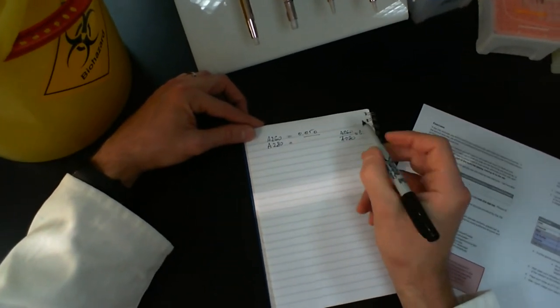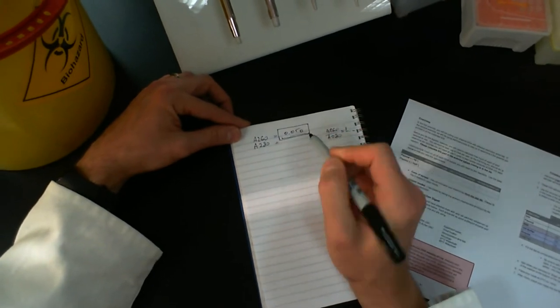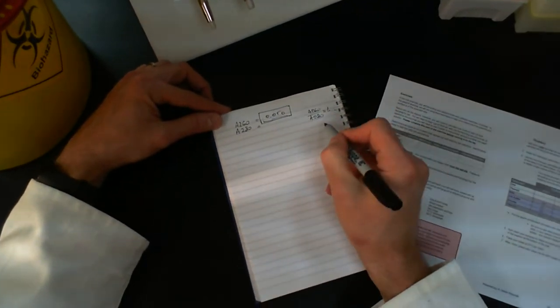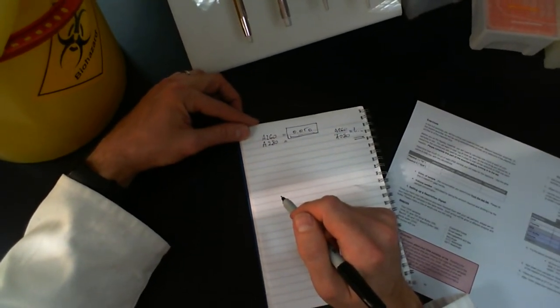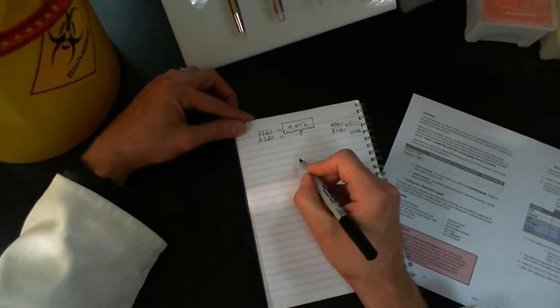What I'm going to work with today is the A260 number. This is an absorbance value, and we're going to turn that into the DNA concentration. Because your sample is not going to be pure, it's not going to be a very accurate number, but it's going to give you a rough idea of how much DNA you might have in your sample.